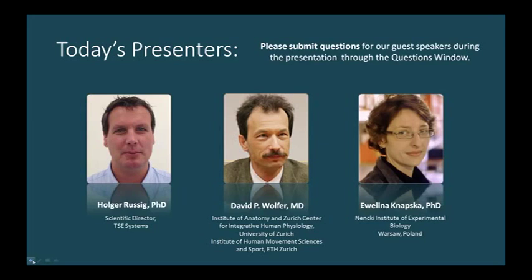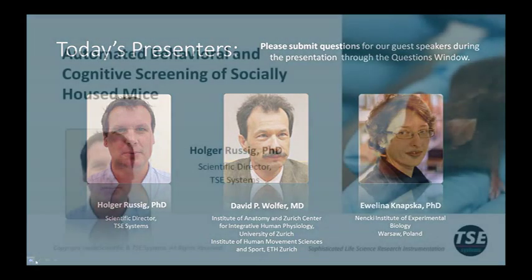Her research interests focus on the mechanisms by which different populations of neurons affect processing of emotional states in the brain and on novel experimental paradigms suitable for such studies. Today, she will be talking about specific methods for monitoring different measures of mouse behavior at the same time and comparing different behaviors in well-balanced conditions in the IntelliCage system.